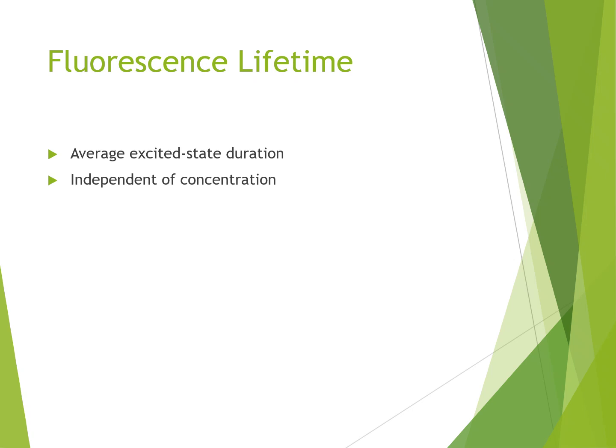Now we will discuss the fluorescence lifetime, which is the average time a molecule remains excited before the emission. So it is the lifetime, how long a molecule remains excited before the emission. It is independent of concentration and intensity. So fluorescence lifetime is the average time a molecule remains excited before it emits.